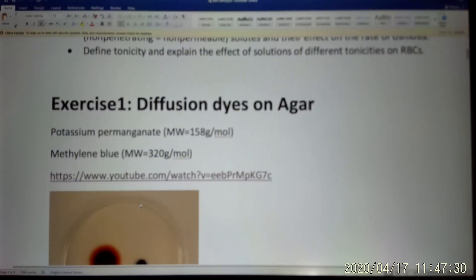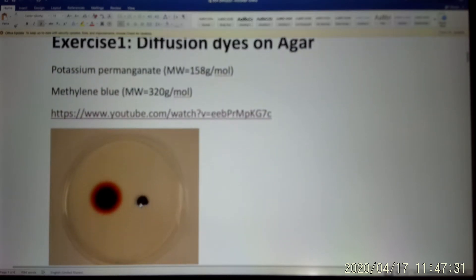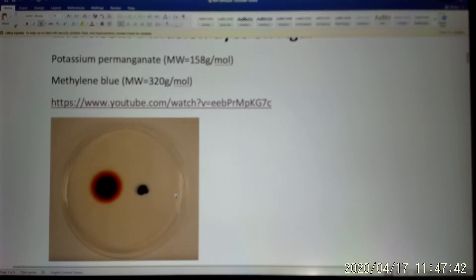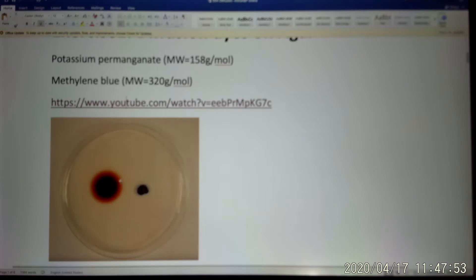The first one is the diffusion experiment. We put the dye on the agar. The agar is like water — it is 99% water — and agar slows down the movement of the dye. So we use two different kinds of dye. The first one is potassium permanganate, which is a red-orange color. And the second one is methylene blue. The molecular weight of methylene blue is twice more than potassium permanganate.